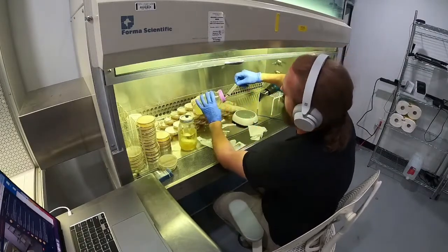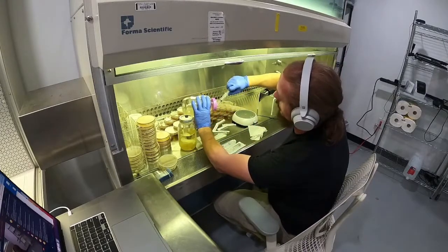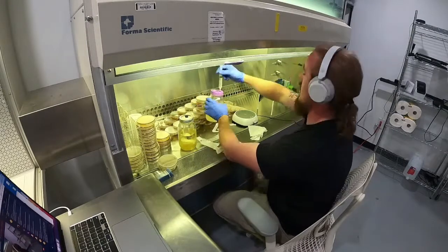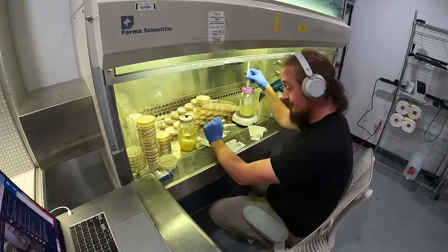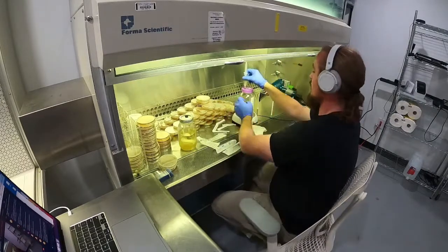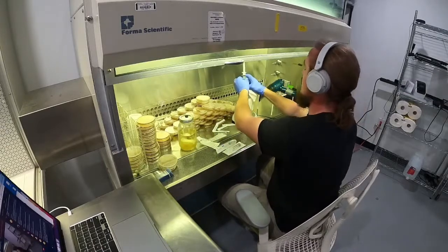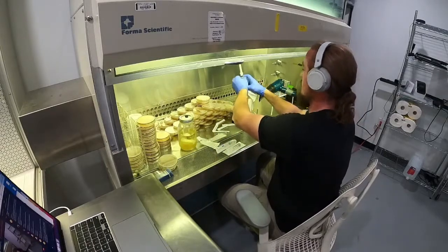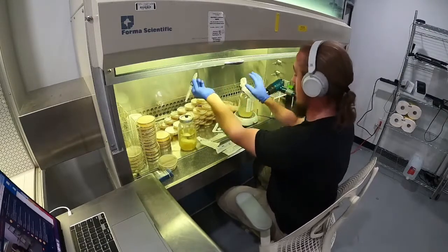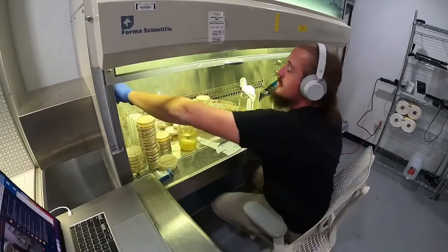Anyways, liquid culture versus agar is really a bit of personal preference. Like I said, we do agar to grain for masters. So we'll make a 3-pound grain bag with one agar dish. Then we'll do a grain-to-grain expansion of that, using 10 more bags. So that one master bag goes to 10 more grain bags. And then Bob's your uncle. There's my syringe tips.